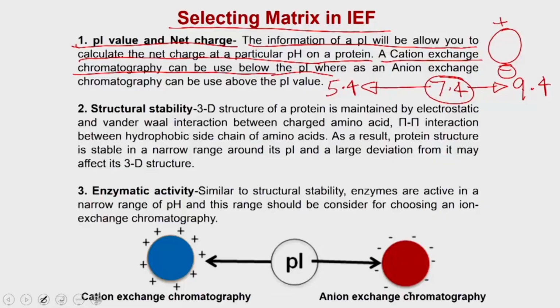Now, the second criterion is structural stability. You know that a protein is a three-dimensional structure, and this 3-dimensional structure is maintained by electrostatic and van der Waals interactions between the charged amino acids.